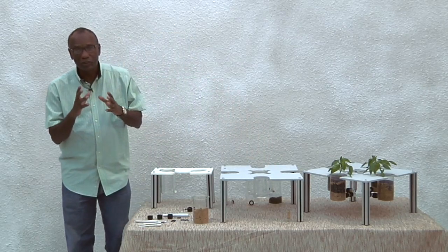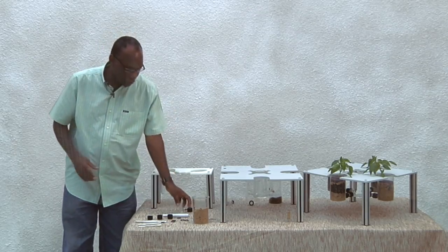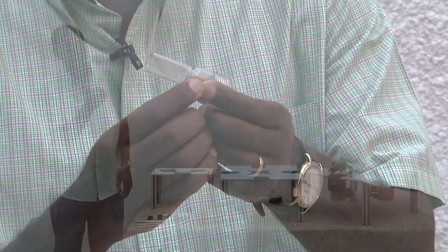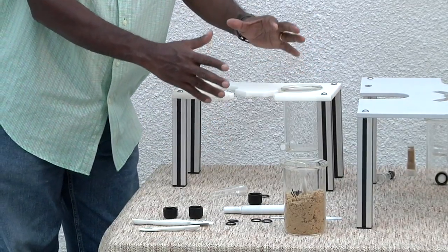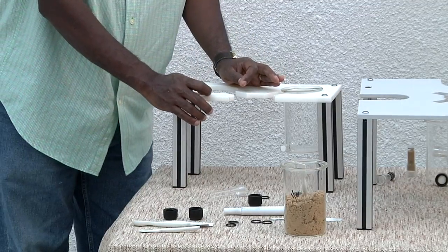And the third component, which is the key to getting the olfactometer to work, is the nematode collection chamber. I'm going to demonstrate how to assemble the plant growth chamber with the attachment of the nematode collection chamber.